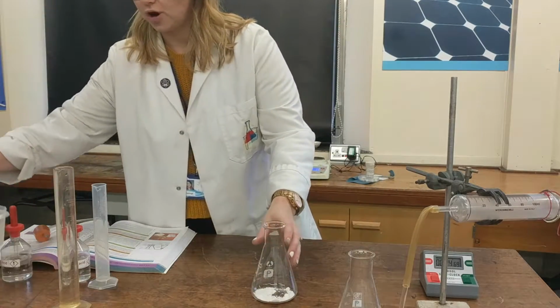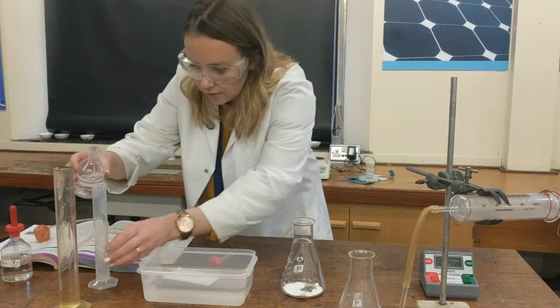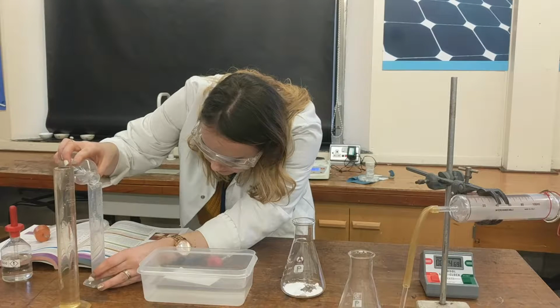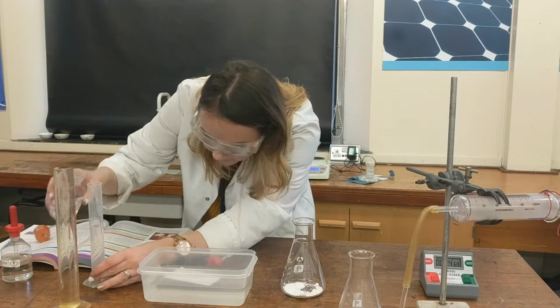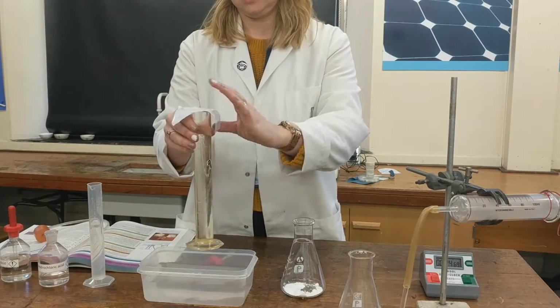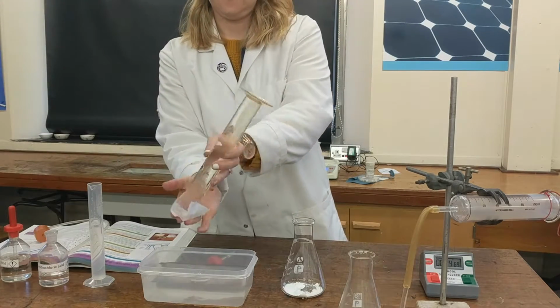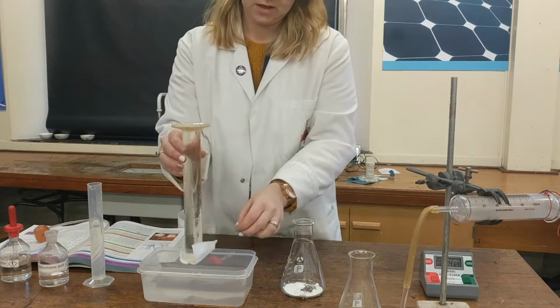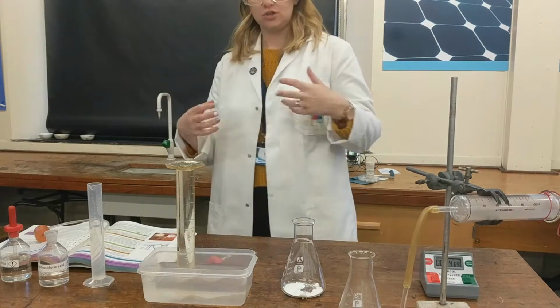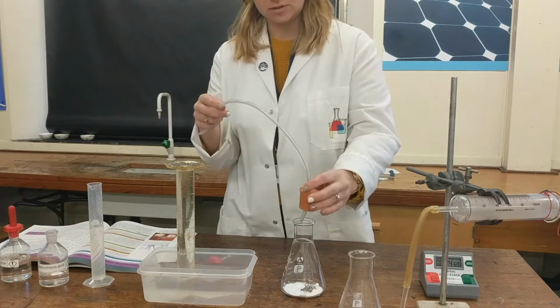So the other one is using a water trough. I've got a measuring cylinder here full of water. Let me just measure my 40 centimetre cubed of acid again. Okay. So let's see if this works here. A magic trick. It's a bit of surface tension to flip it over, and then place that underneath the water. So you know you've got 100 centimetre cubed of water in there to try and displace it with 100 centimetre cubed of gas. So, similar kind of setup to the gas syringe.